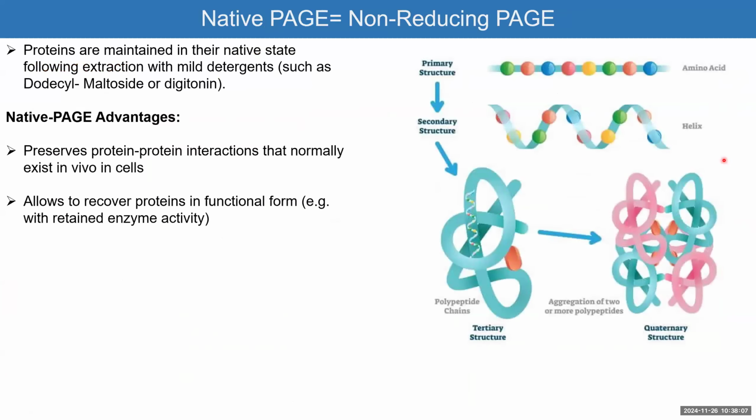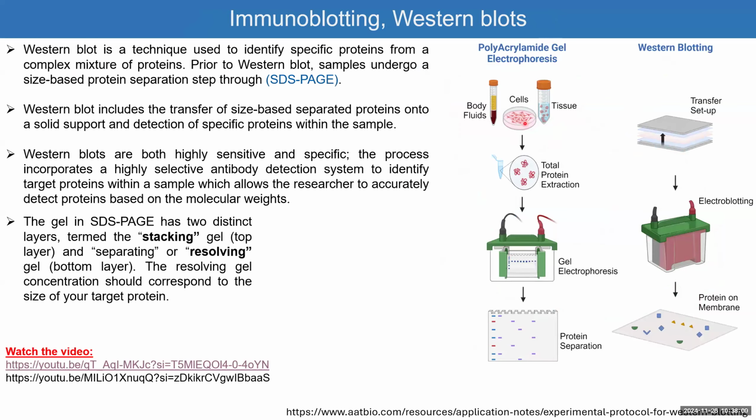So if we look at this, it's telling you that the polyacrylamide is the first step where you isolate proteins, run them on the gel in similar amounts, and you have them in the gel, you transfer them, and now you have the membrane ready.